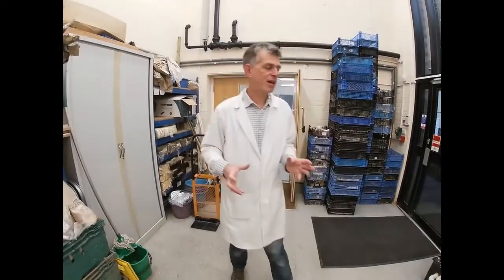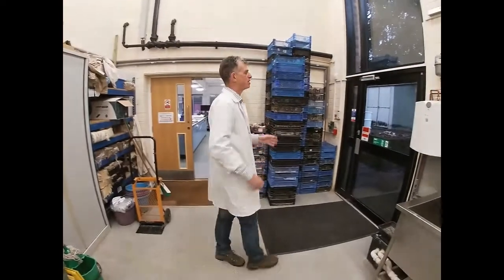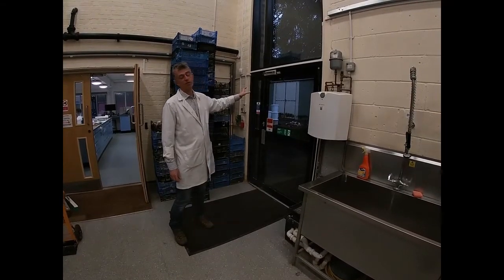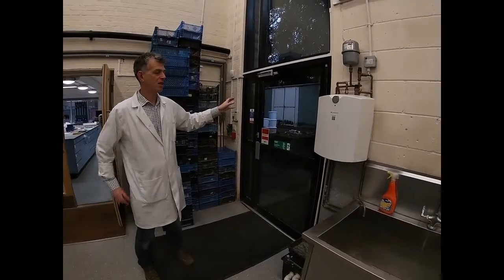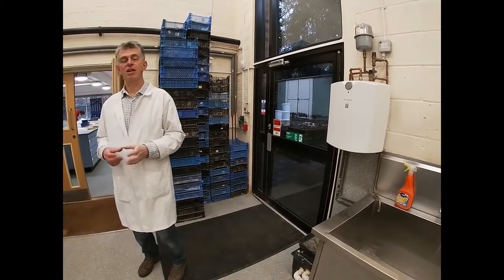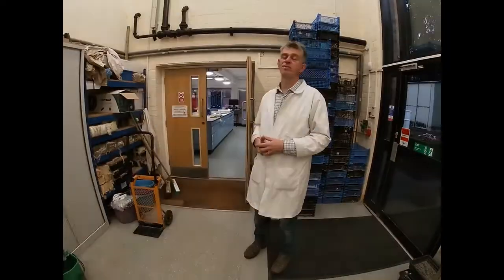This room tends to be a relatively dirty facility. We also expand outside, so this is an exterior door, and we've got various other equipment in a series of storage sheds outside, and we might also carry out some of our processing of sediments outside as well. So we're going to move through from this dirty area into the clean parts of our laboratories, and we're going to go into our analytical laboratory.